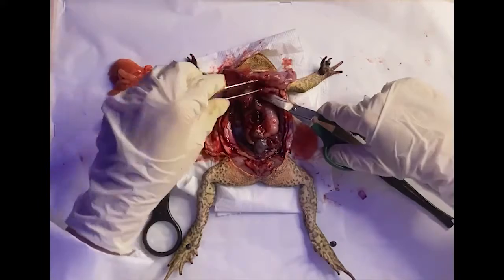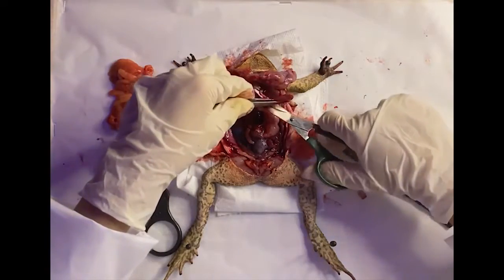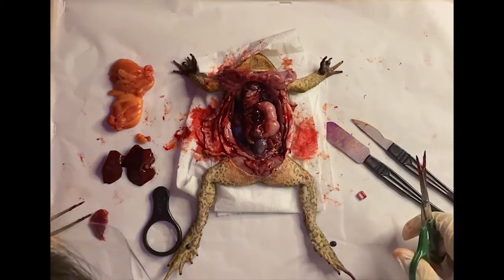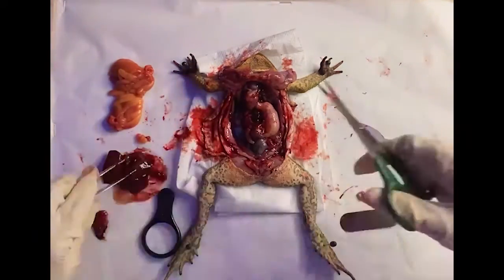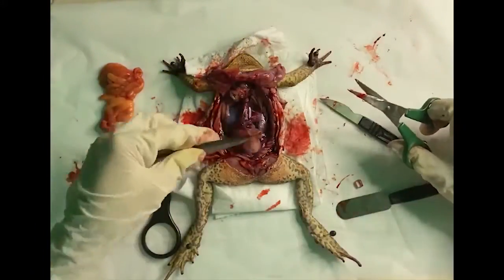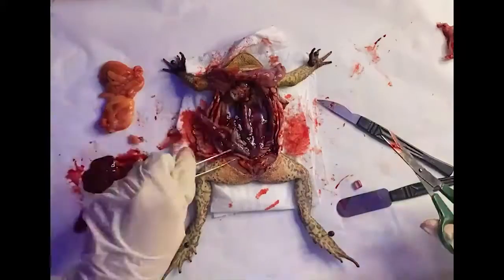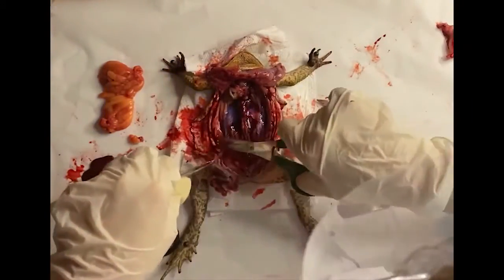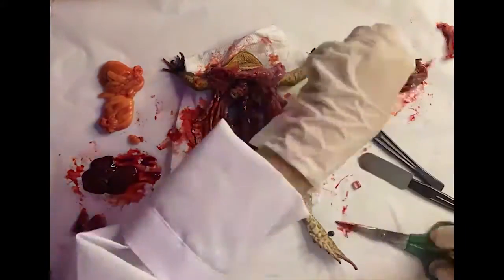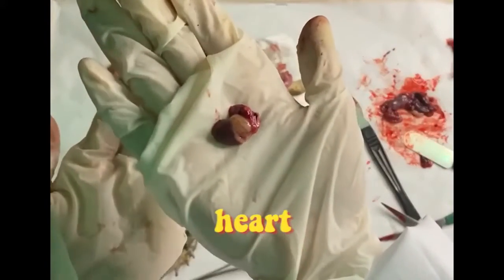And next, I will be removing the lungs. Now, I am also removing the stomach. Next, the large and small intestines. Here is the frog's heart. It's still slowly beating.